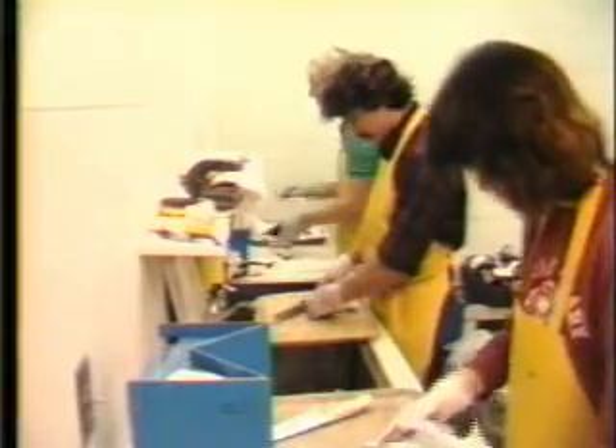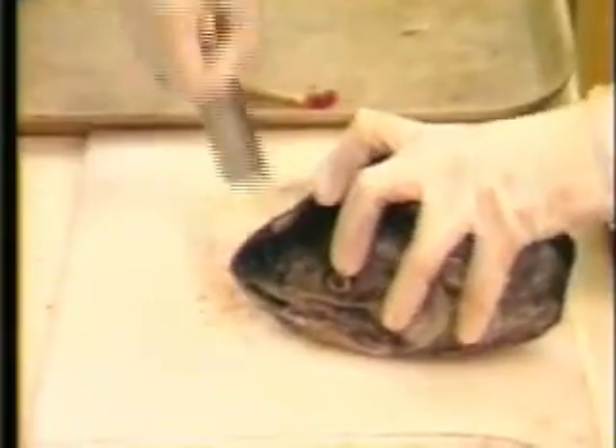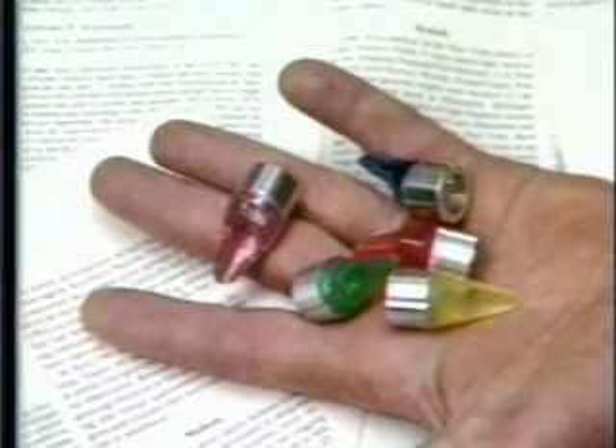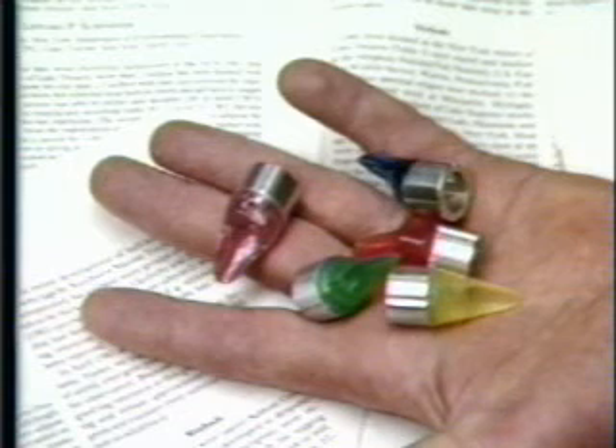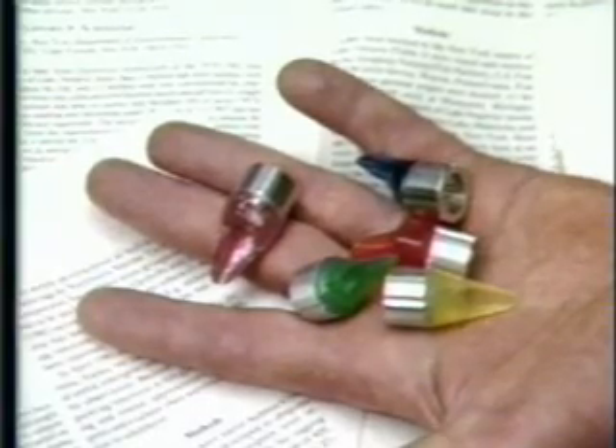Practical considerations include such things as potential difficulties in recovering and/or detecting tags from fish that have grown enormously since tagging. Northwest Marine Technology offers a service in examining new species and suggesting anatomical locations for tagging. Although positioning jigs may become useful for other forms of coated wire tagging, we are only aware of their common use in snout tagging salmonids and certain other species.